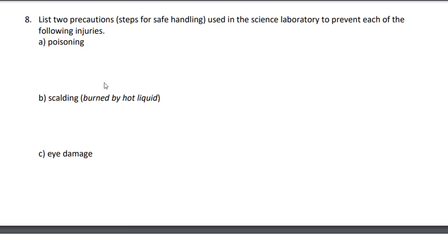So again, these are test questions. This exact question is a test question. You want to make sure that you have 2 good answers for each one of these things. And that it's not like the eye wash station where that's preventing further damage. It's a precaution, not a caution after the fact. You want to make sure that you are never actually causing the injury in the first place, okay? So have good answers for that.